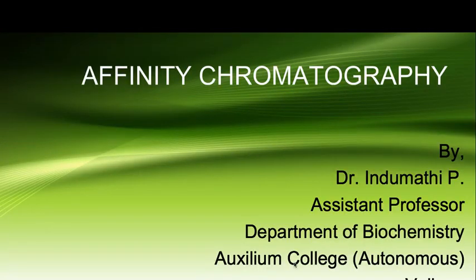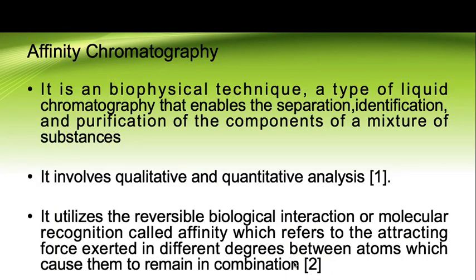Today's topic is on affinity chromatography. What is affinity chromatography? It is a biophysical technique, a type of liquid chromatography that enables separation, identification, and purification of components from a mixture of substances. It involves both qualitative and quantitative analysis. It utilizes reversible biological interaction that refers to the attracting force exerted by the different atoms that cause them to bind in combination.